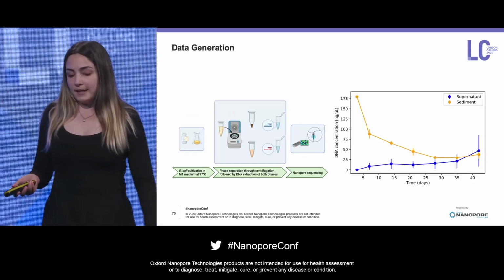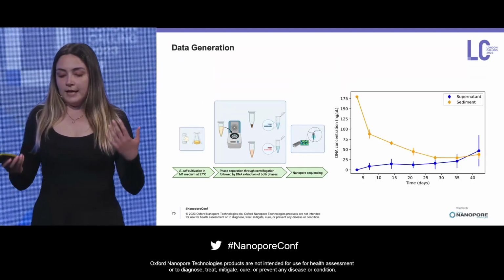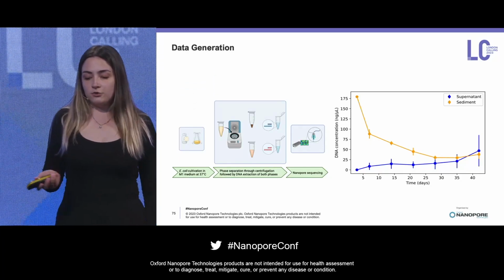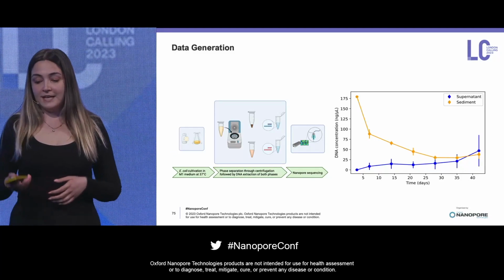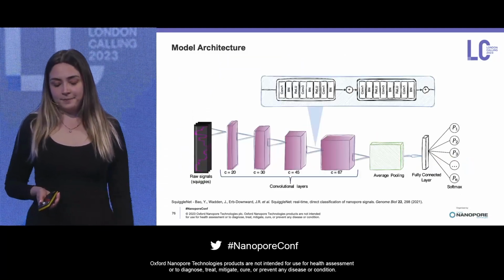And as we expected, we observed an increase in DNA concentration of the supernatant and a decrease in the sediment.